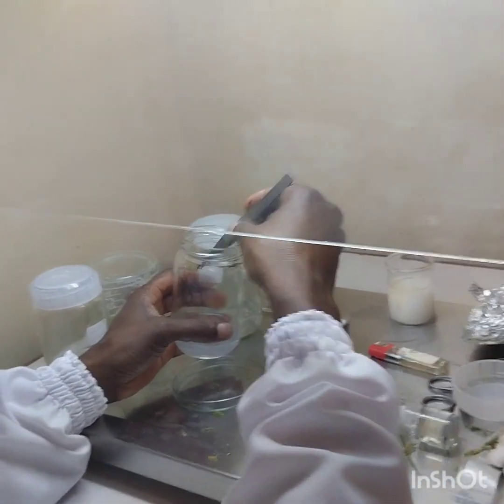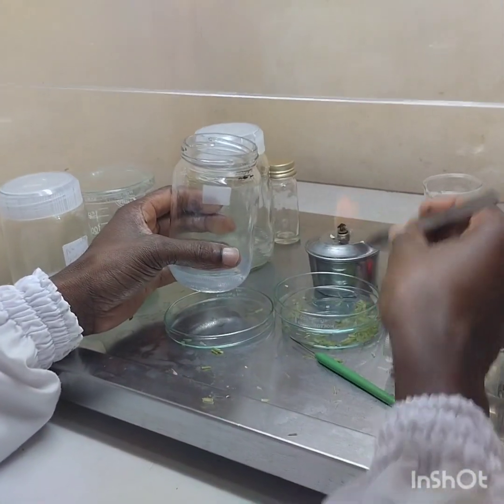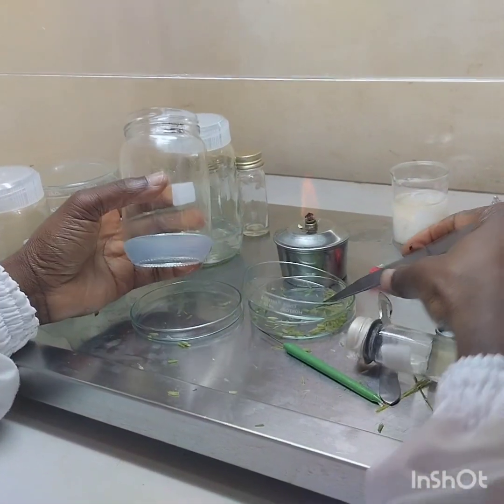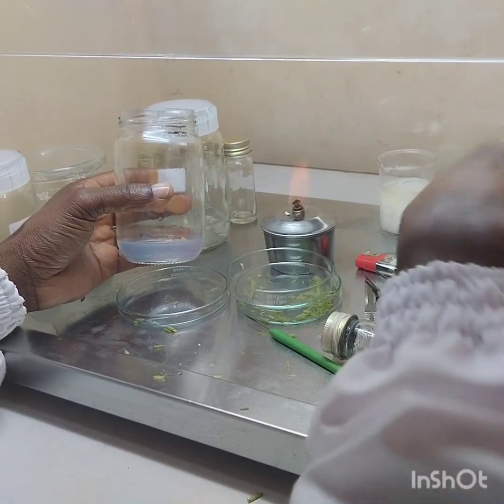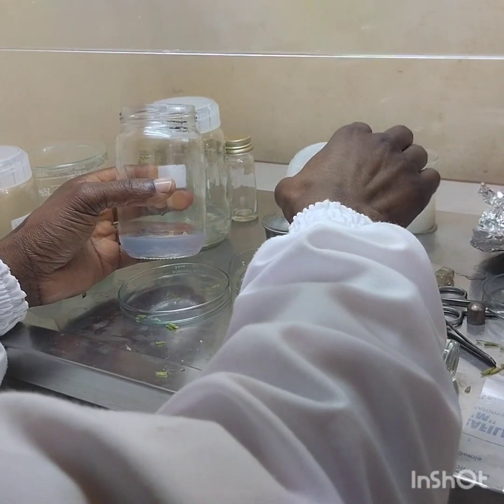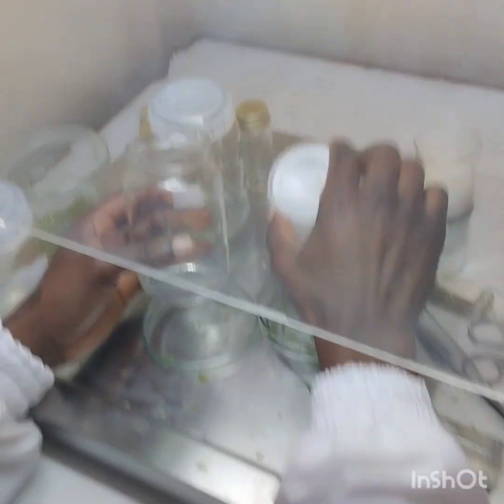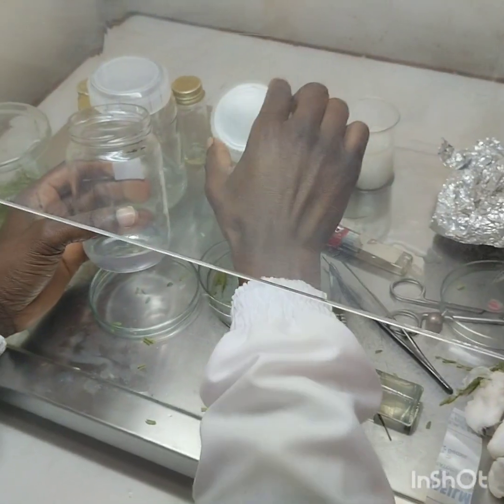This process of anther culture requires high levels of sterility because the nutrient-rich media is easy to contaminate. There are fungi and bacteria that can be introduced into the media and then grow and disrupt the growth of the anthers into plants.